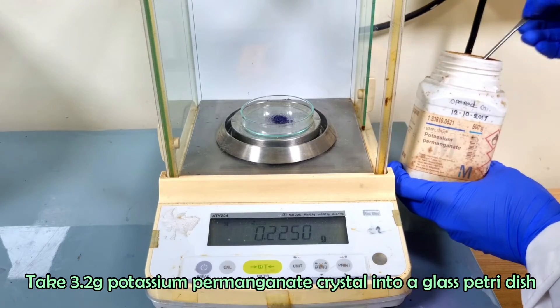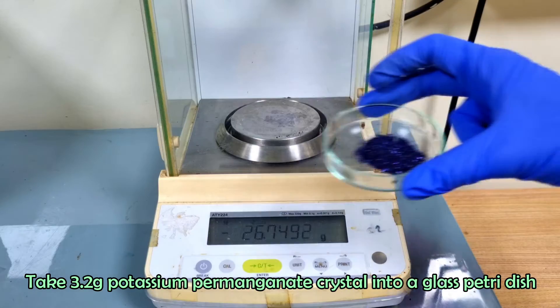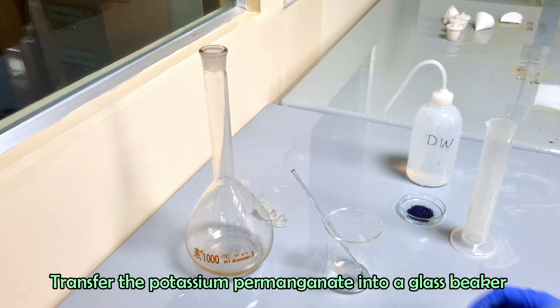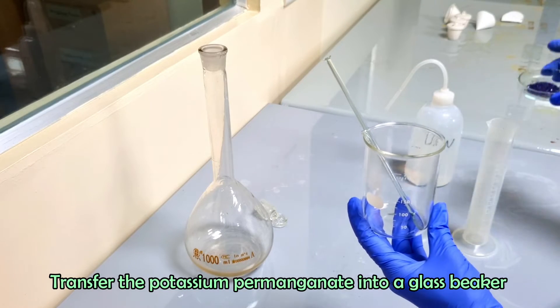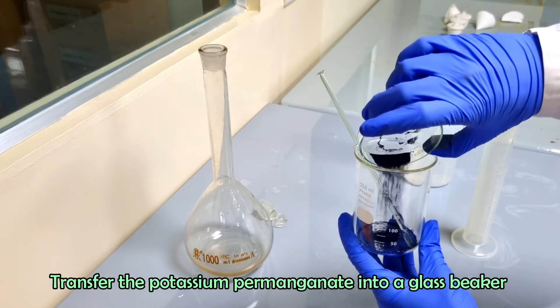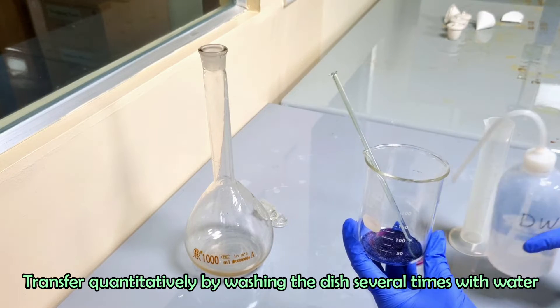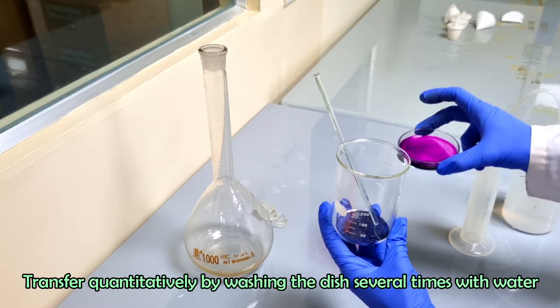Take 3.2 grams of potassium permanganate into a glass petri dish. Transfer the potassium permanganate into a glass beaker. Transfer the potassium permanganate quantitatively by washing the dish several times with water.